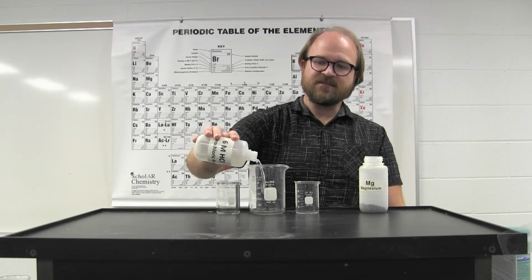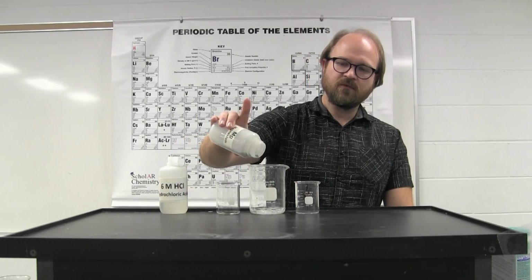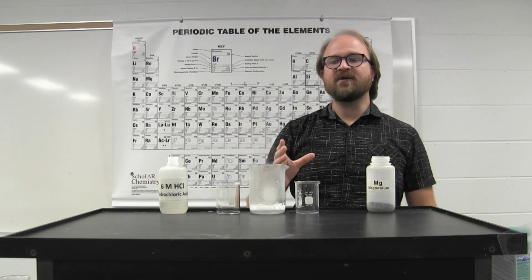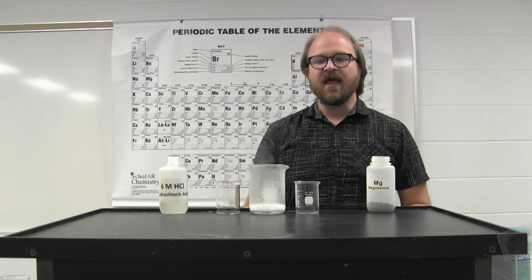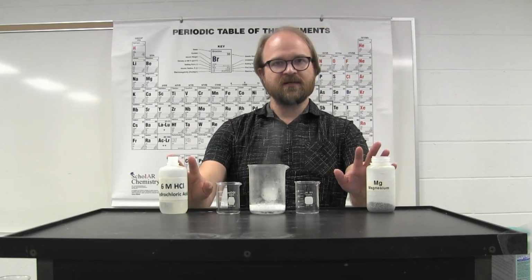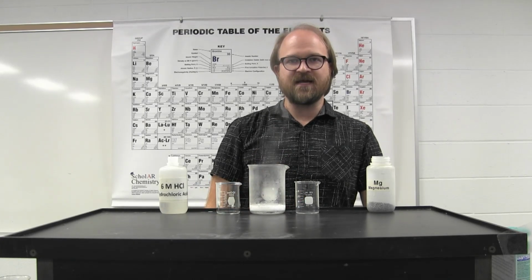So by mixing these two together, the reaction can progress. And you can see that it's generating the hydrogen gas, it's bubbling, it also generates a lot of heat.